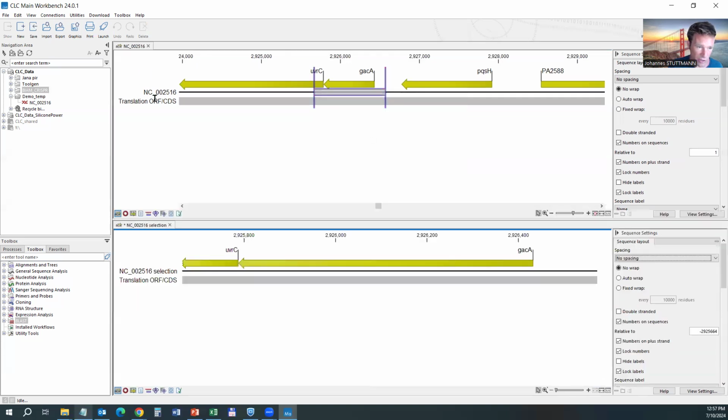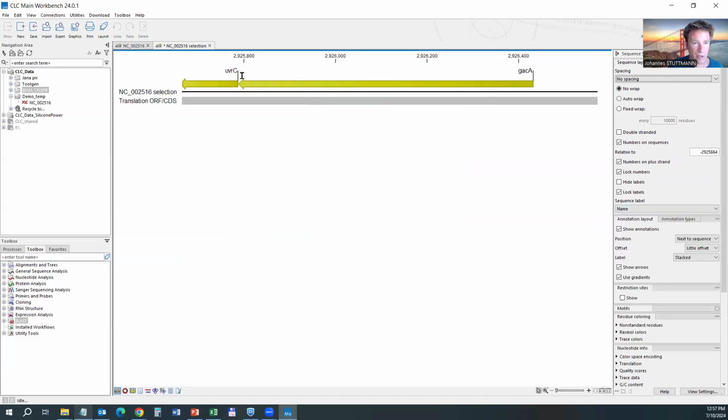And now I get again a split view, just like before when I was searching on NCBI. And maybe now I move this here to have it displayed bigger. Once again, I'm a European and I'm a bit limited sometimes with my brain, so reading sequences from the right to the left is really not an easy exercise for me. I want to have the ATG on the left-hand side and the stop codon on the right-hand side to not get confused. Also, it doesn't change anything.